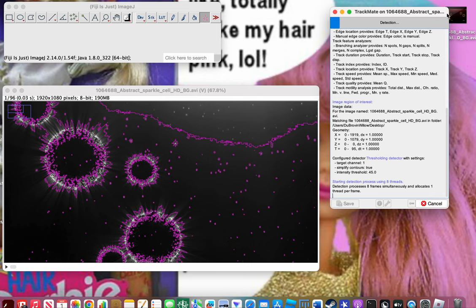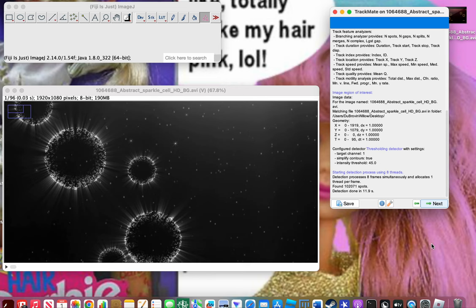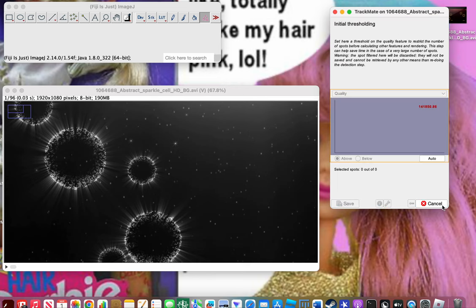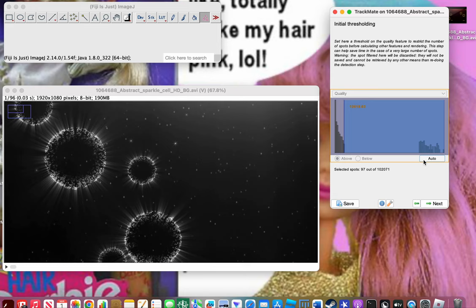Then this is going to load — some people don't have this step but if you do, just let it load. Then the next screen doesn't require much — just click Next.